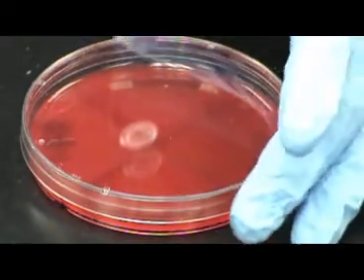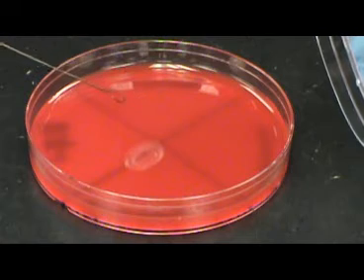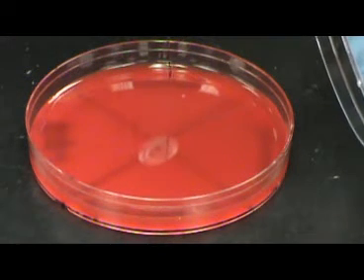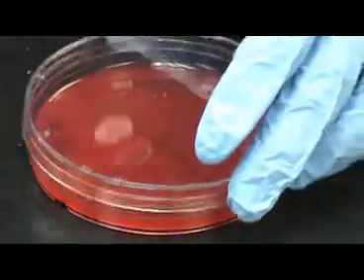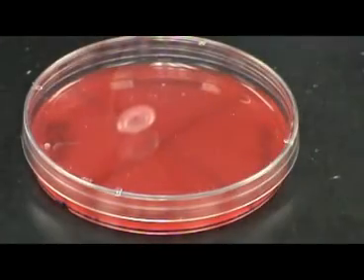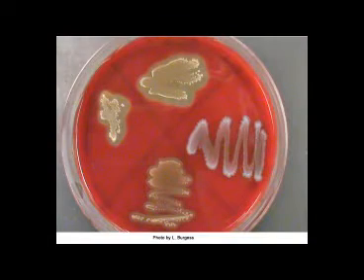In the second technique, a straight line inoculation is also completed, but is then followed by stabbing the agar with the loop. 4 to 5 small punctures into the agar will introduce bacteria into the media and into anaerobic conditions. Shown here is a completed blood agar plate.